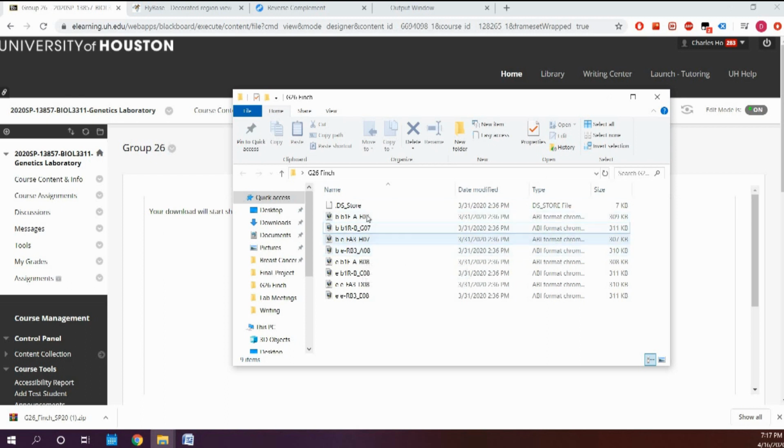Because when you do your complementation cross, how do you know the flies that we're actually working with are black, right? That they actually have a mutation in black. They could actually have a mutation in ebony, per se. So this is kind of like a control experiment to show that your flies are indeed mutant for black and not mutant for ebony. And here is to help you find the specific mutations that are causing your ebony fly. So let's start with ebony.